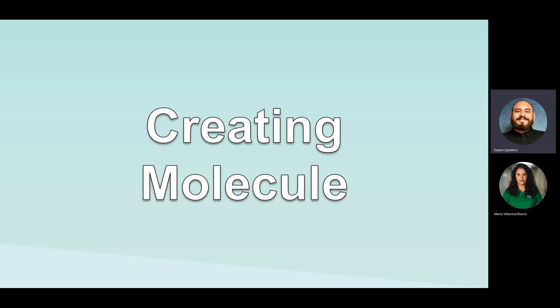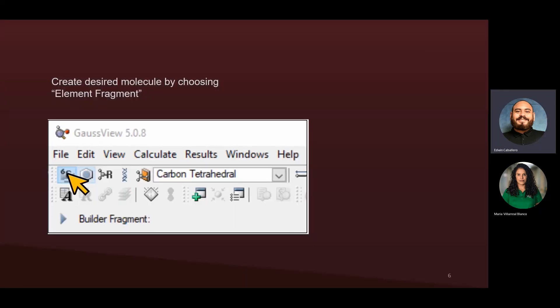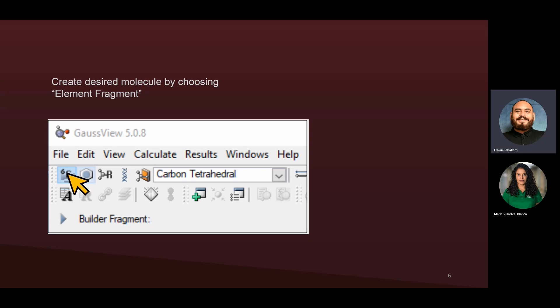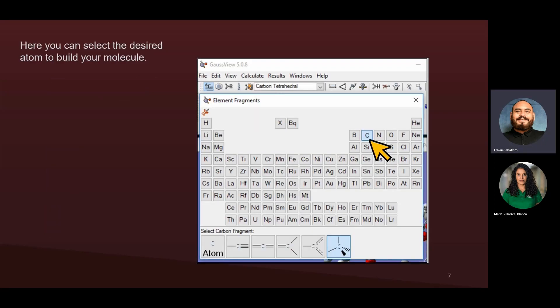Let's start with creating a molecule. The first thing we're going to do is select the element fragment icon on the GaussView program. GaussView is a different program than Gaussian — Gaussian is where you do the simulation, while GaussView is an interface that allows you to set up everything. It's translated into code which is then run on Gaussian. You'll click on the element fragment icon and have the option to choose a specific element to use to create your molecule.